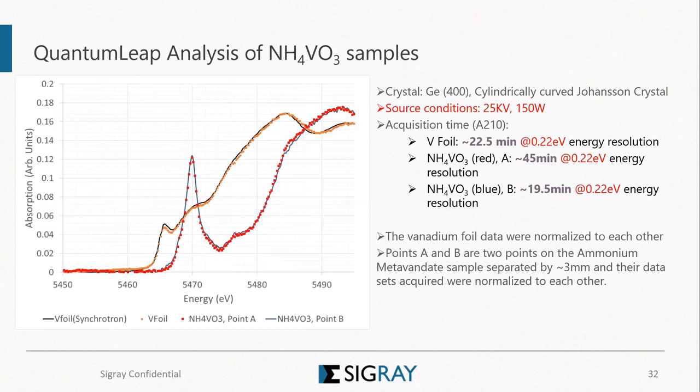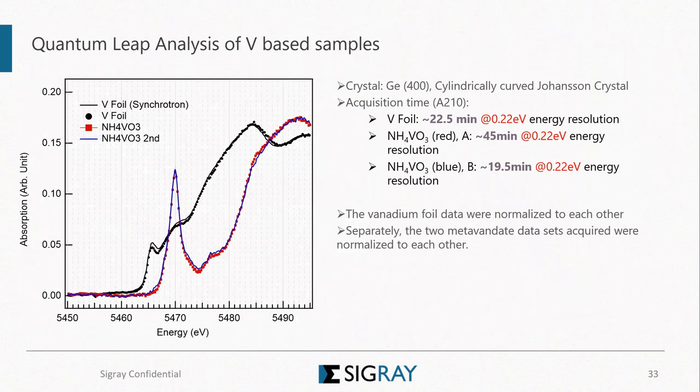So this is another vanadium sample we ran. Again, it's in the tens of minutes, 10, 20 minutes level, and we compare with what we measured, also showing the repeatability between different measurements. And these two samples were commercially purchased, because one of the customers could not give their sample, so they asked us to buy commercial samples, and we measured, and they were pretty happy with the measurement.